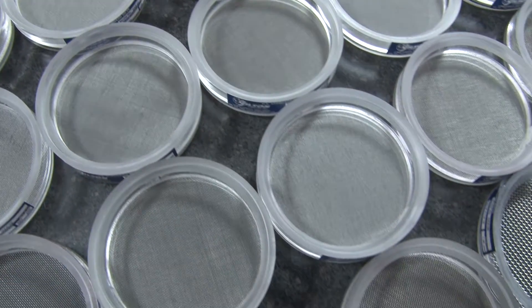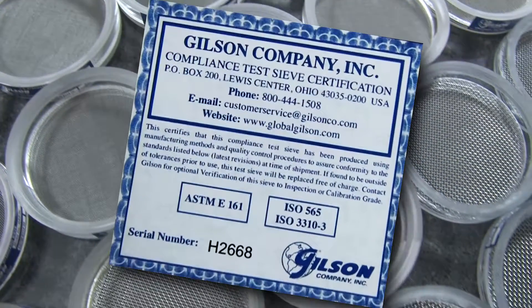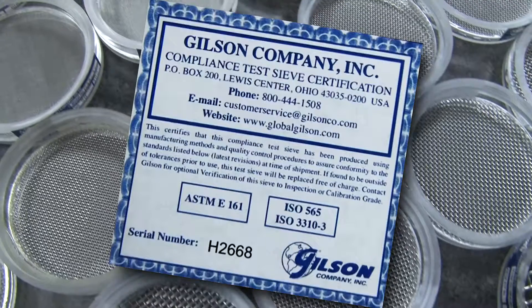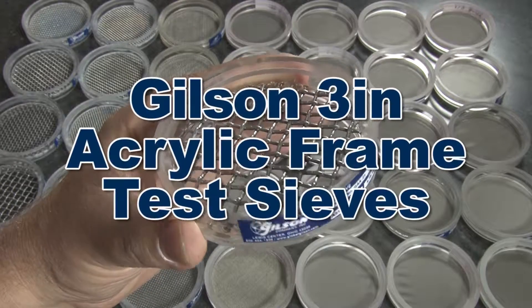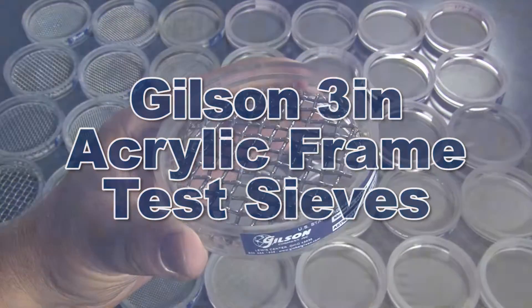Each sieve is serial numbered and comes with a manufacturer certificate of compliance to the appropriate standard, making the Gilson 3 inch acrylic frame test sieves the right choice for your material testing lab.